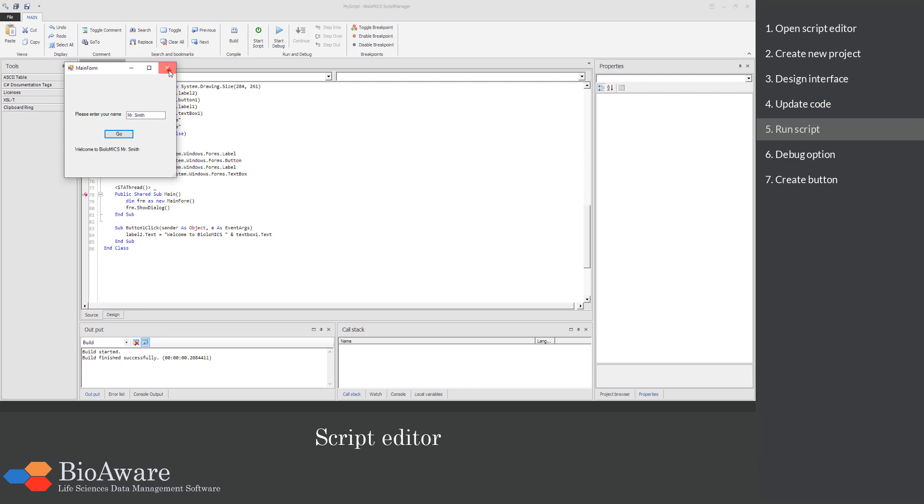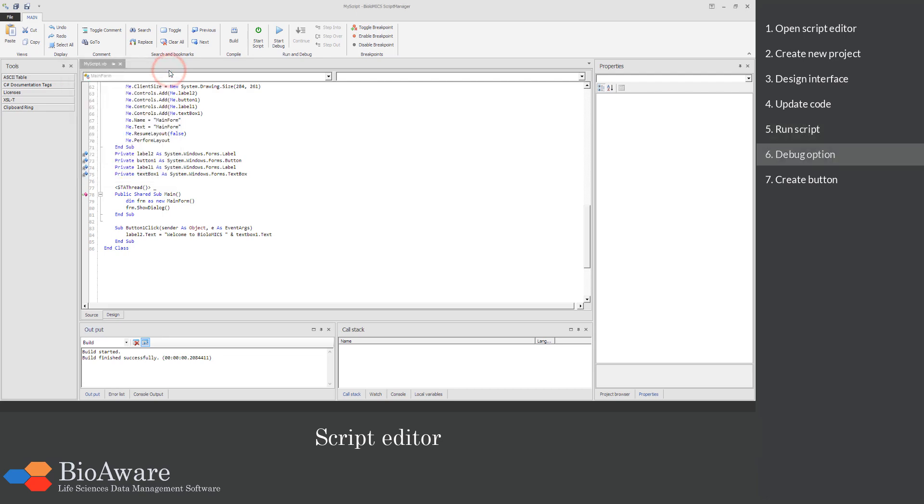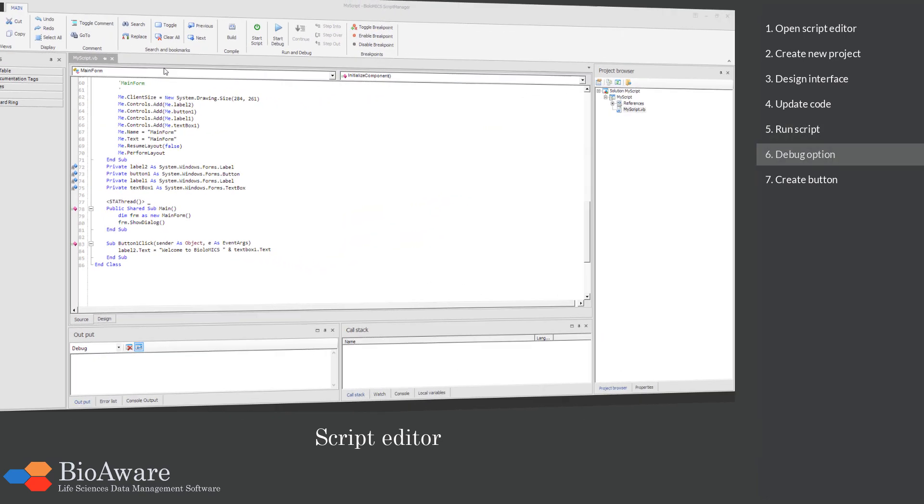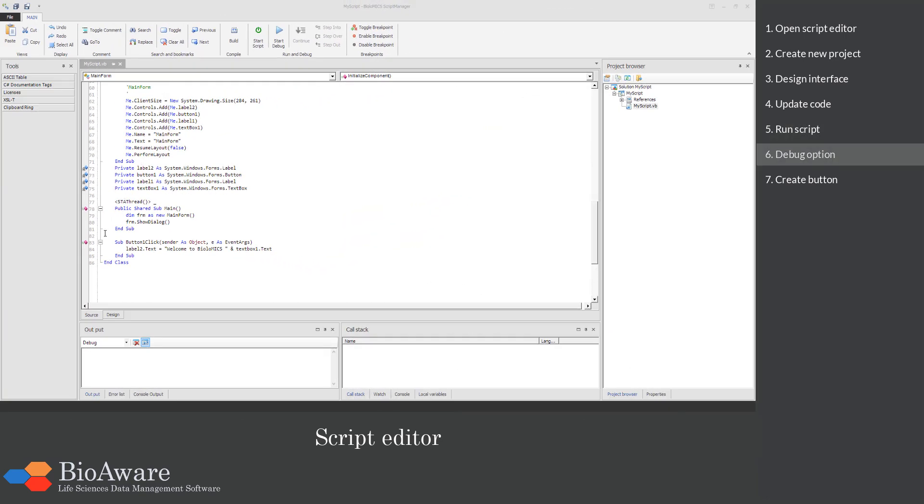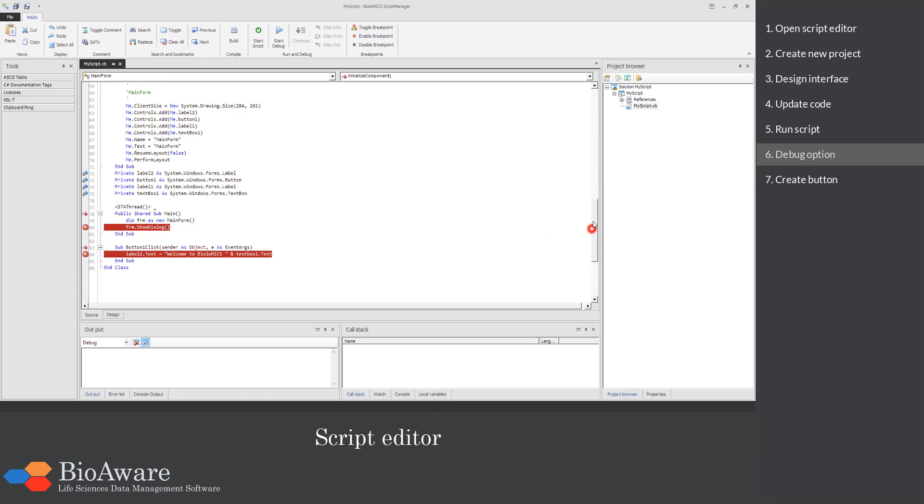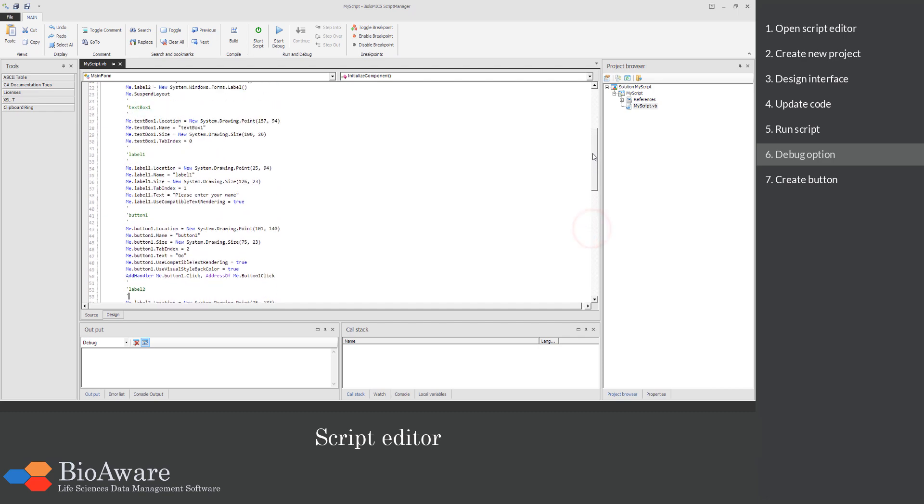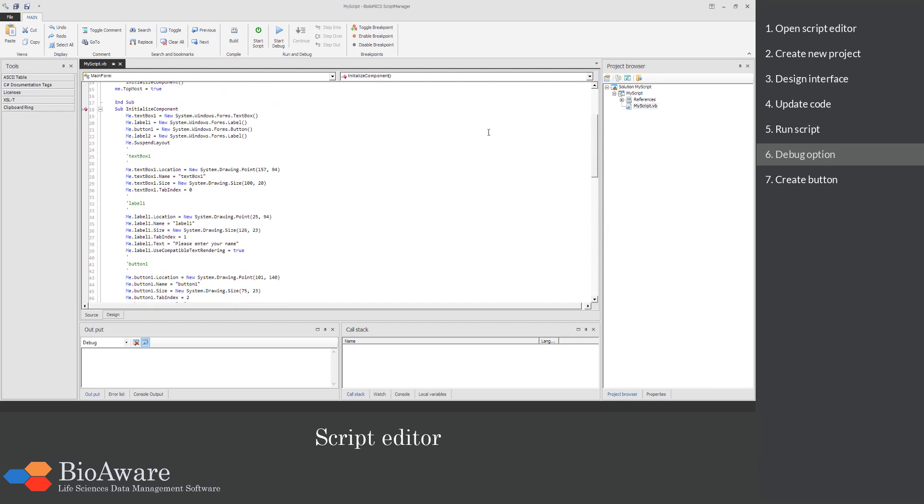When you are not familiar with scripting or you are stuck, then you can use the debug function. Put breakpoints within your script and go step by step through the lines and see the output of each line.